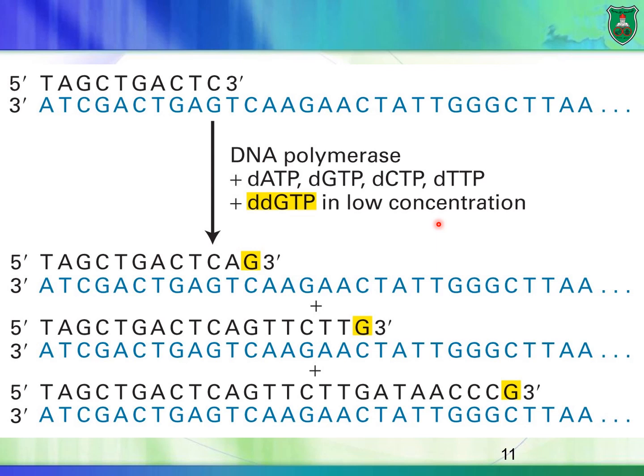Now the DNA polymerase would start, and each one of them would have a primer attached to it, or hybridized or annealed to it. Now the DNA polymerase would start DNA synthesis. Okay, so it starts right here. T, it adds an A. C, aha, wait a second. There's a C, so it has to add a G, right? There are 2 G's in our reaction.